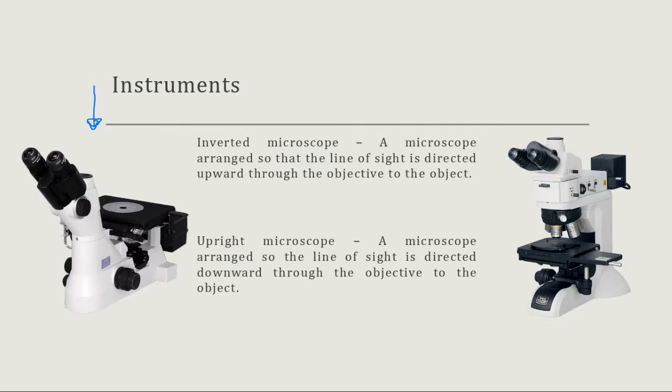On the other hand, for the upright microscope to work, not only do you have to have a polished sample that's flat, but also the back side of the sample. So if you are not producing samples that are perfectly parallel, like if you plane the surface of your mount that has a sample, then when you put it on the microscope backside down, you're not going to have the best reflectivity.